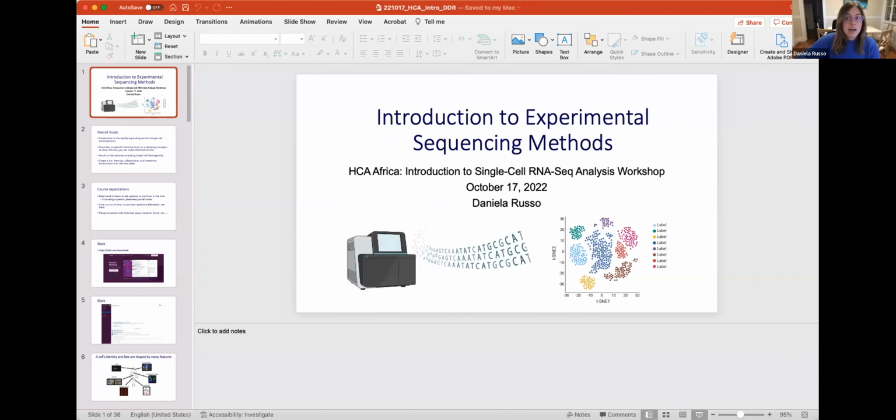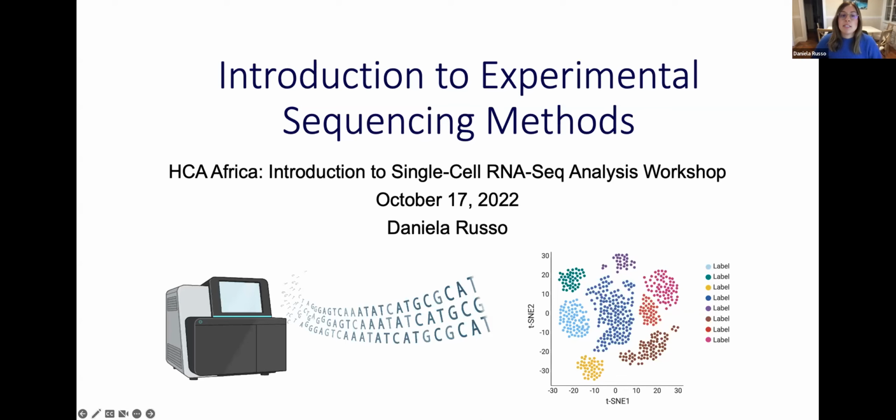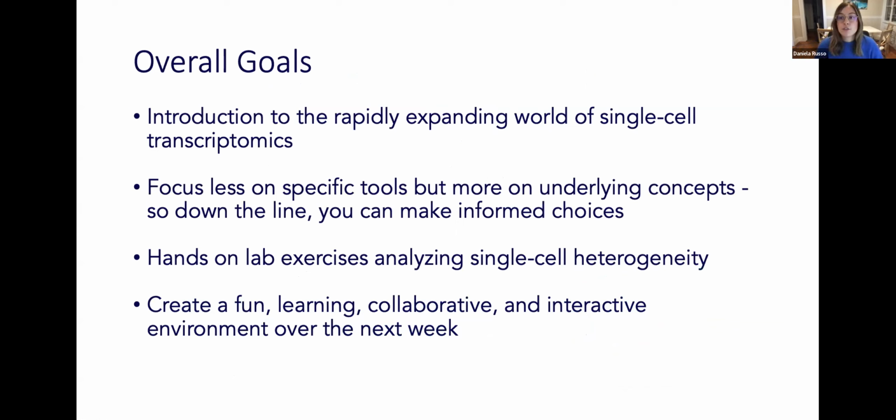Thank you. Hi, everyone. Welcome to the first lecture of this series. Like Christine has just mentioned, I'm going to discuss some experimental sequencing methods. For today, our overall goals are, first and foremost, to introduce you to this rapidly expanding world of single cell transcriptomics and really try to focus less on specific tools, but more on the underlying concepts. This is to give everyone an opportunity to understand a good chunk of the breadth of the field, and then later make informed decisions based on that information.